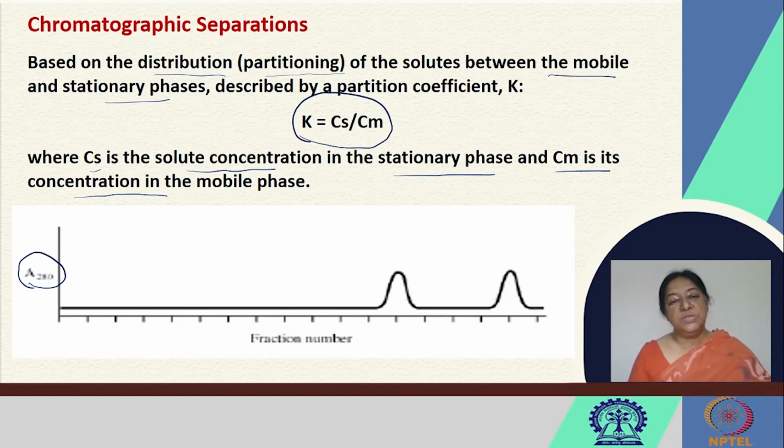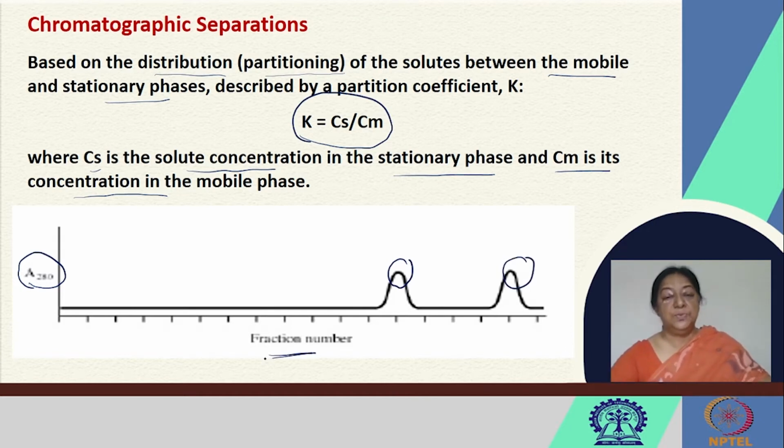Assuming that the proteins that we are going to isolate in this case do have aromatic amino acid residues present, we have absorption at specific fractions of our collections that we are going to be looking at in a moment that tell us that these particular fractions are the ones that have proteins in them.